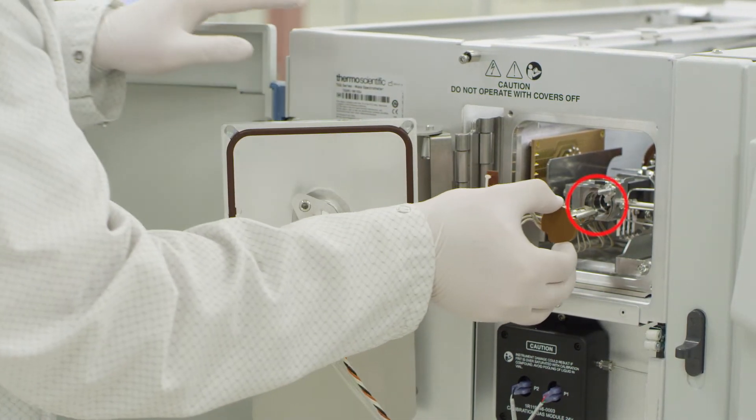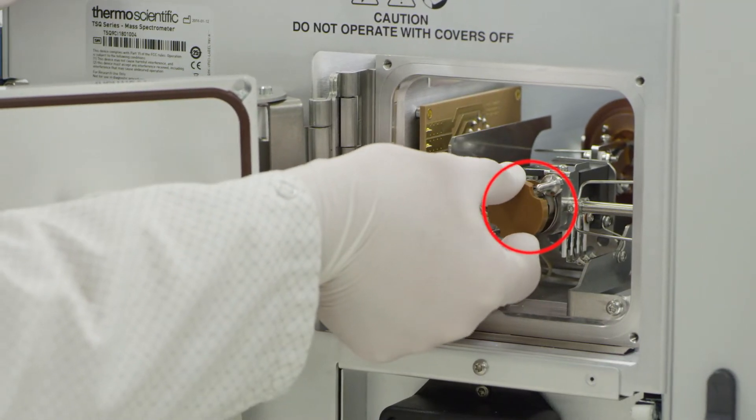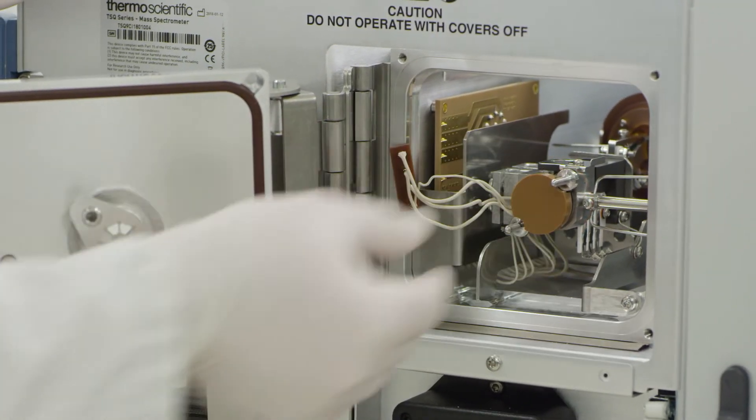Carefully insert the AEI source so that the filament connections are oriented towards the left and the cutouts fit around the thumb screws.